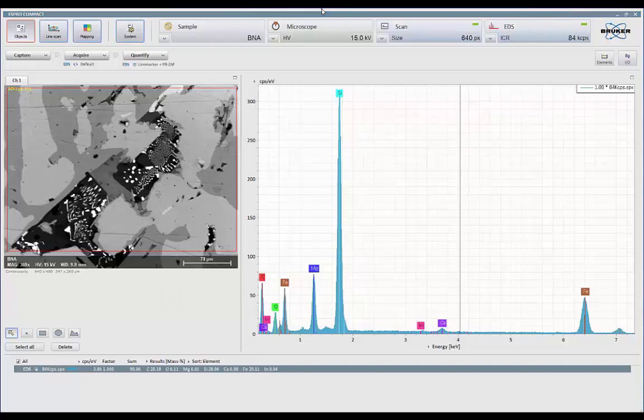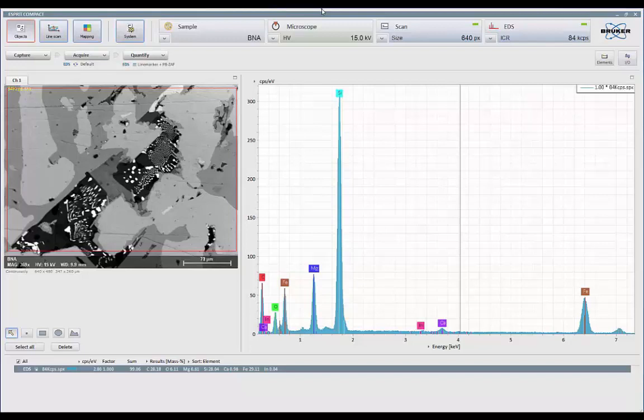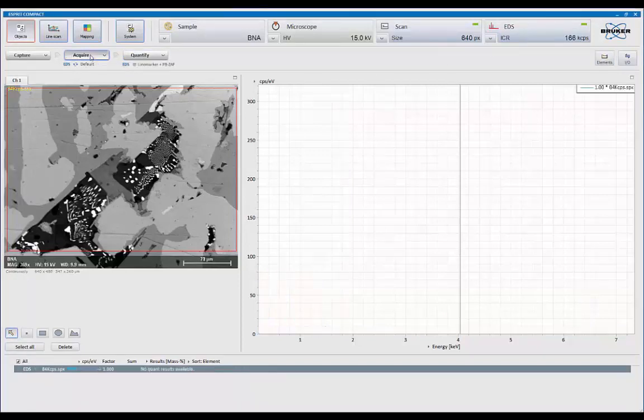And just for the fun of it, let's increase the condenser lens a little bit more. Let's see if we can get it up to... So we're about 167,000 counts a second. Let's do another acquisition.